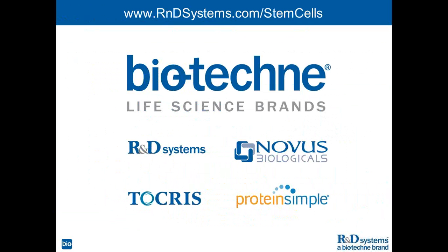So the kit for ectoderm takes the cells to very early ectoderm, so it's a very short 5-day protocol. Why it was originally developed was to be able to do a quick, easy verification of your stem cells. So if you're interested in looking at early ectoderm and making sure your cells are able to go down that lineage.